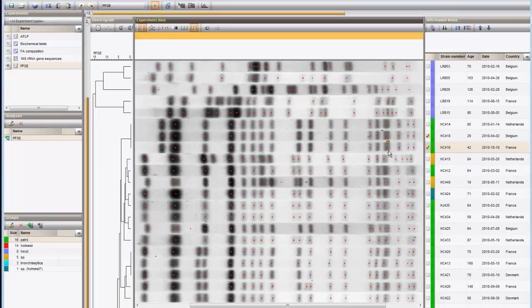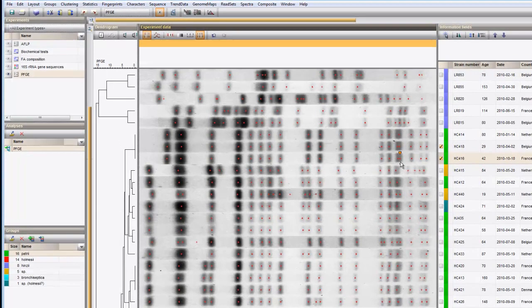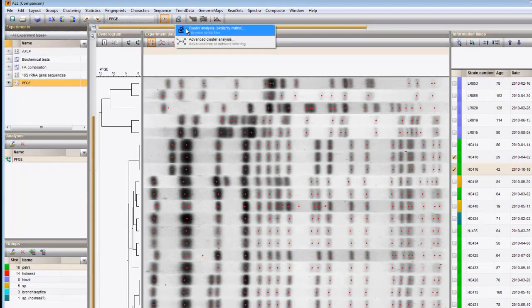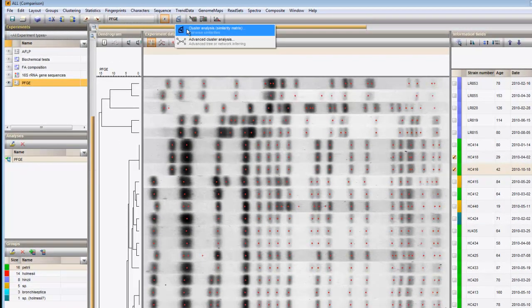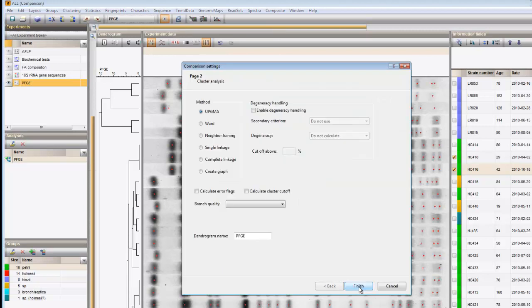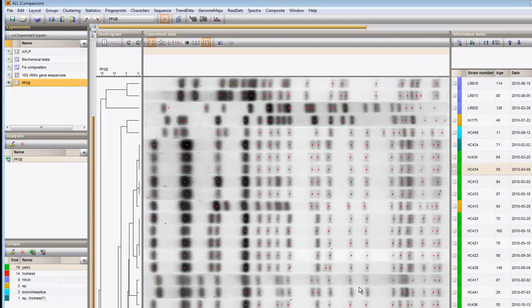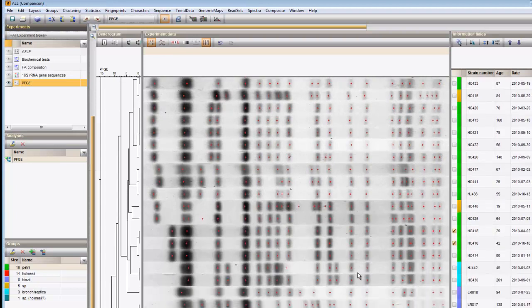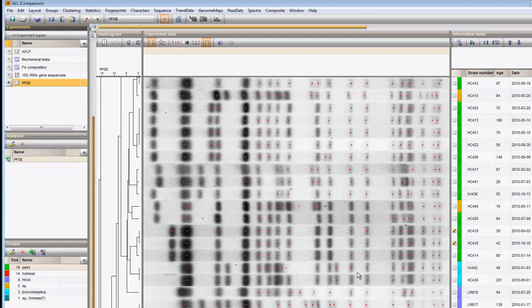I will now cluster the patterns again to update the tree. The two selected patterns now cluster at zero distance.